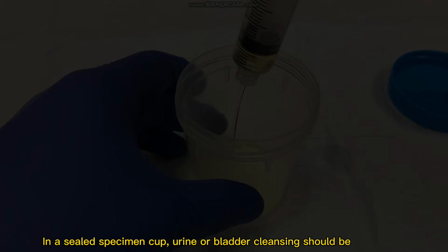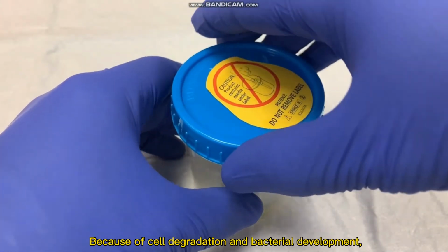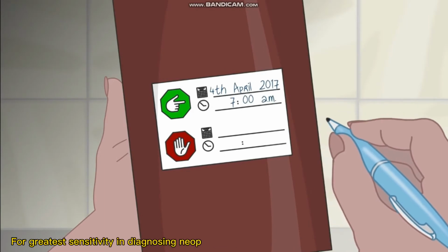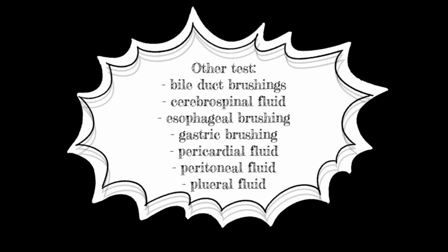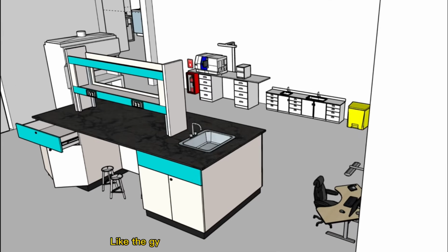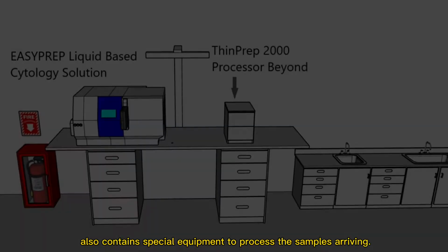In a sealed specimen cup, urine or bladder cleansing should be submitted. Because of cell degradation and bacterial development, cytology is not suggested for 24-hour urine or urine from a collection bag. For greatest sensitivity in diagnosing neoplasm, 3 voided urine samples are recommended. Other tests in this section include bile duct brushing, cerebrospinal fluid, esophageal brushing, gastric brushing, pericardial fluid, peritoneal fluid, and pleural fluid.